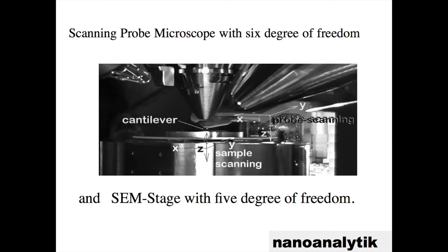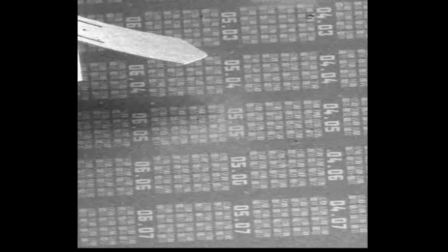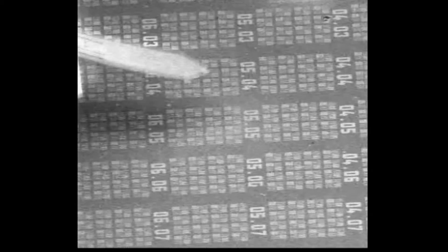In this slide we can monitor the position of the AFM and SEM system after introducing it into the SEM chamber. Due to the realization of six degrees of freedom in the system we are capable of addressing the scanning tip over the surface of 18 by 18 millimeters over the sample and take measurements up to a height of 8 millimeters.